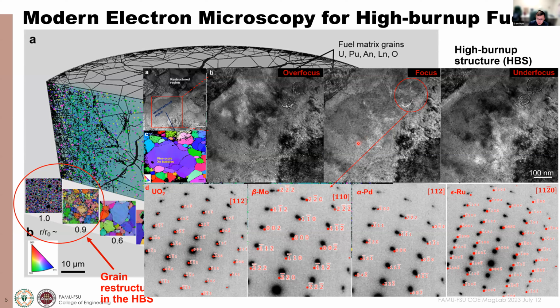Traditionally, when you do selected area diffraction patterns, for example at the top right there are two precipitates, and you can see the structure from the electron diffraction. But this takes a lot of time to interpret for just one image of a teeny tiny area. For more generic microstructure, you need a more holistic view to represent such an analysis.